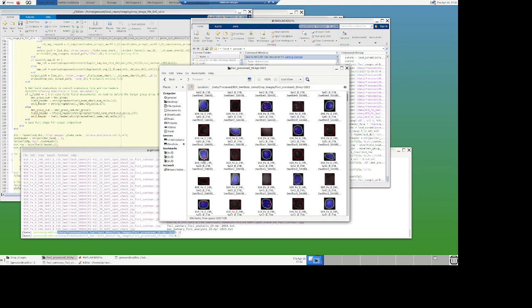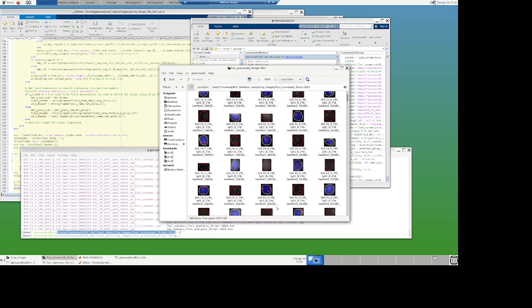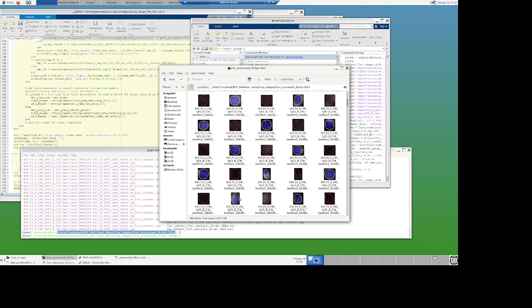Because it increases the value of the wavelet itself, the value itself goes up for some reason. So you see those are pretty dim. They still are nicely picked up because you have very well-defined spots. So you can see how those ones, for instance, were rejected, but those ones were kept. Now it's a setting. You can change this if you're not happy with it. And I didn't tune it too much. I think it's doing a decent job.